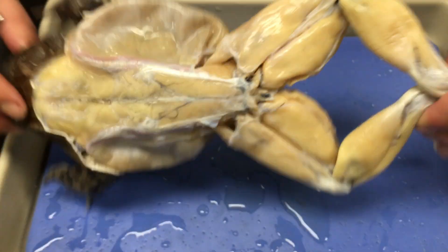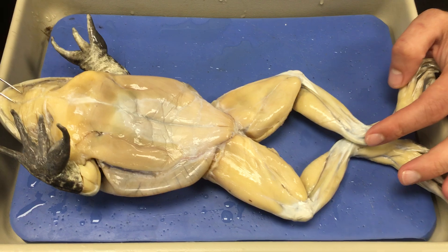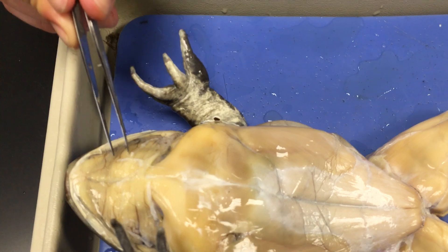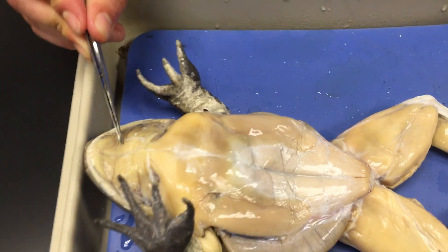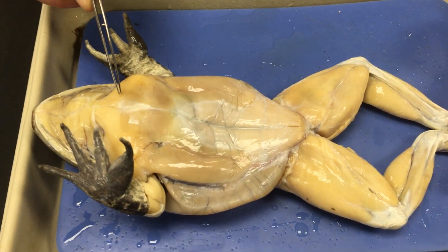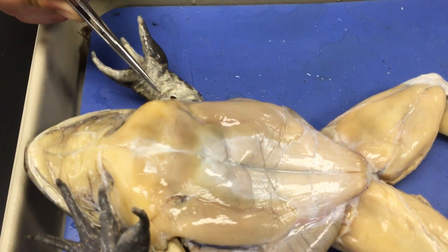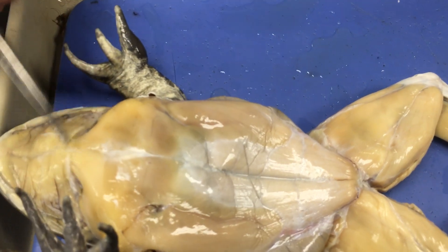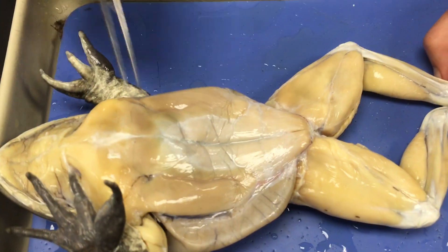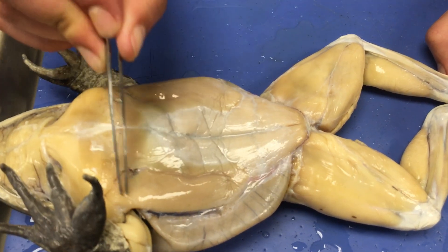Let's now move on to the ventral side. One muscle on the underside of the chin that helps depress the floor of the mouth is called the mylohyoid. Moving down, we get into the muscles of the chest: we have the deltoids, thin muscles associated with the upper arm, and then the pectoralis muscles — just like our human pecs associated with the chest.